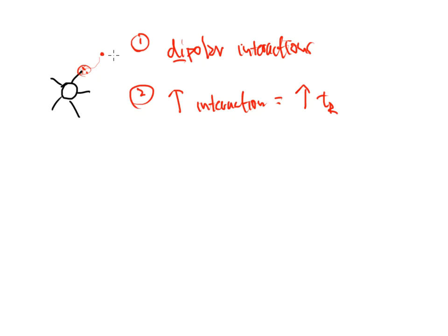All right, so the same thing's happening here with the interaction between the analyte of interest and the stationary phase particle. The stronger the interaction, the more the analyte will be retained. Most of the time, the retention time is going to be determined by charges first. Now, not every single time. All right, I am oversimplifying this whole interaction.